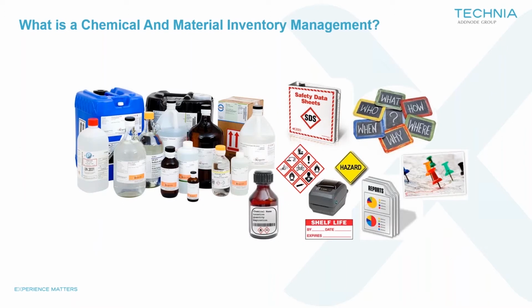So let's ask ourselves, what is chemical and material inventory management? This is basically the management and control of raw materials, samples, biologicals, and chemicals. Companies that utilize chemicals in their labs and their manufacturing processes must manage those chemicals in a safe environment in accordance with government regulations. At a minimum, to ensure that this is accomplished, a system for managing information about the chemical safety and inventory data should be established and maintained.